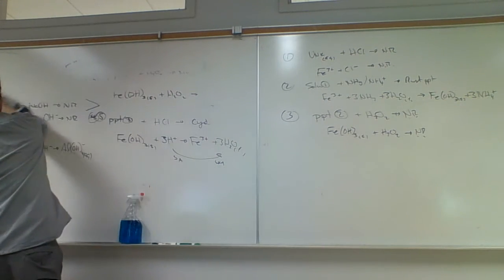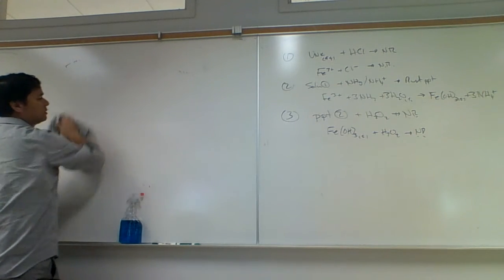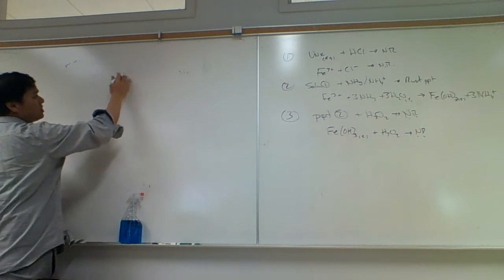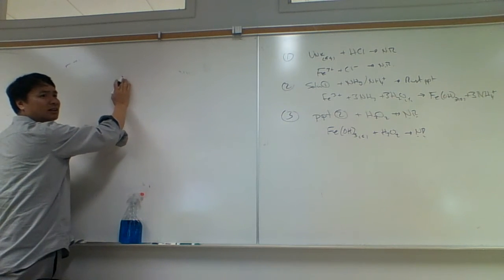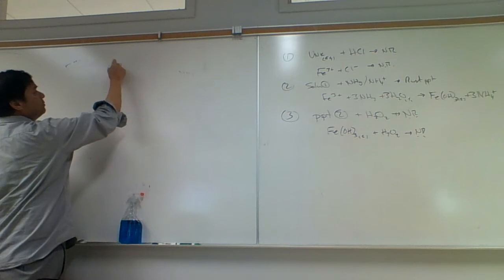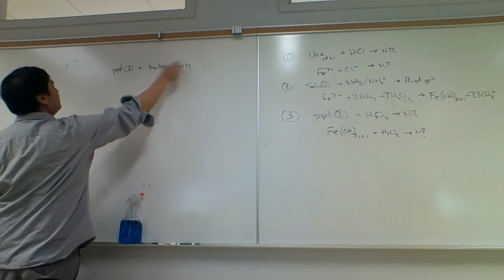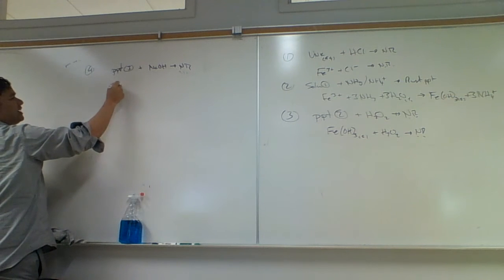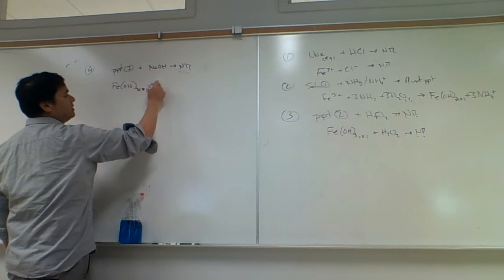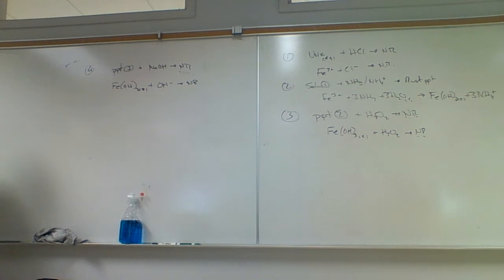Okay, then we go on to 4. The hydrogen peroxide was to get rid of the chromium, and then we have the hydroxide. The hydroxide is to get rid of the aluminum. And so here we'll go with precipitate from step 3 plus the sodium hydroxide yields NR. And so this is step 4. We don't want our precipitate. And so this would be the observation, this first one, and the equation would just be this. Whereas aluminum will react with that, the aluminum hydroxide.